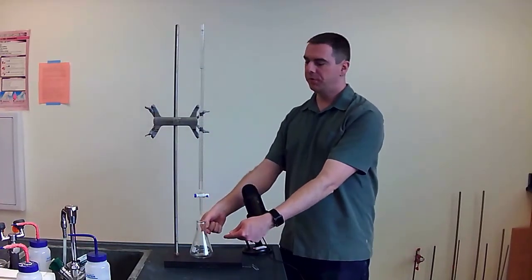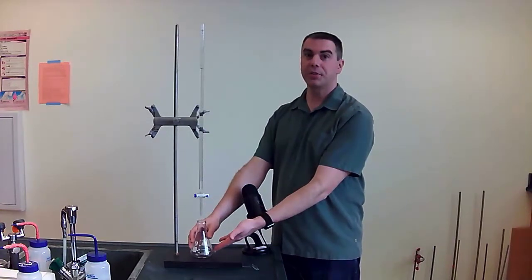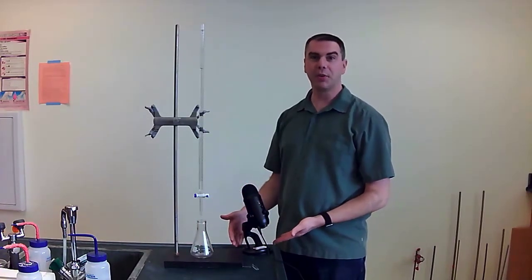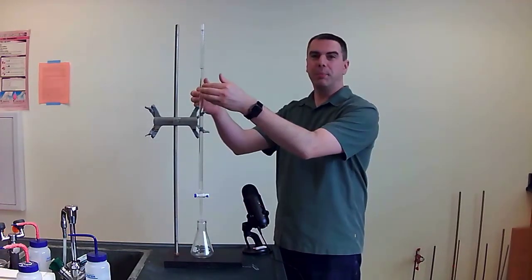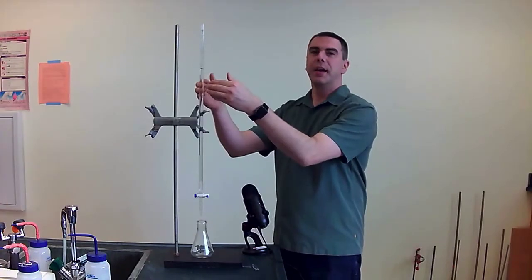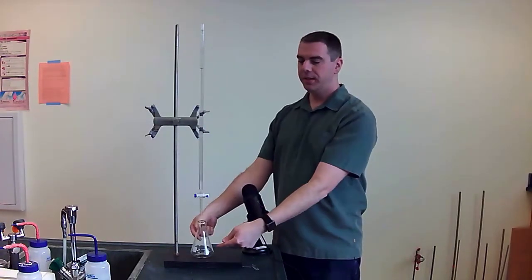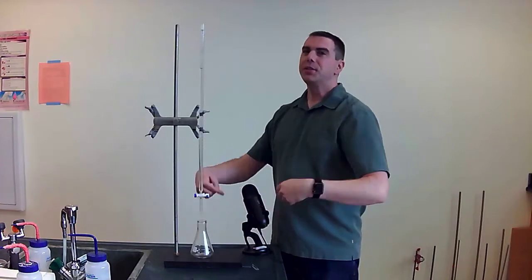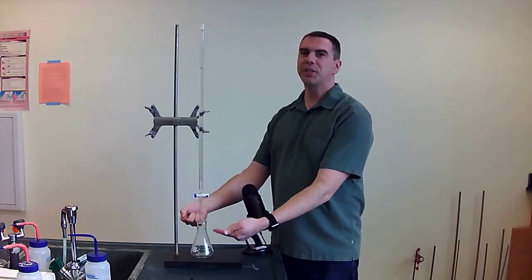You'll have a reactant down here in, for example, an Erlenmeyer flask sitting next to my giant microphone. You have a reactant down here and you have the other reactant up here, say A and B. You're trying to add just the right amount of B into your flask until reactant A is entirely consumed.